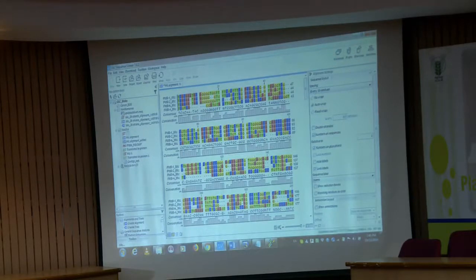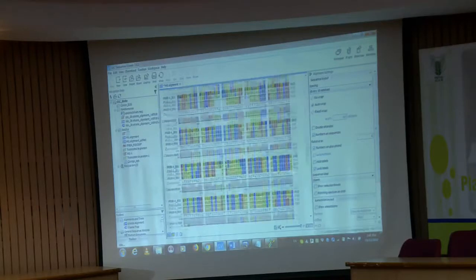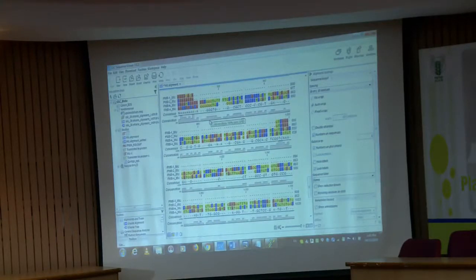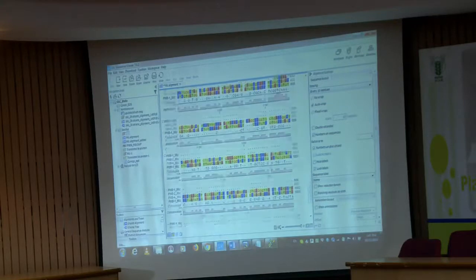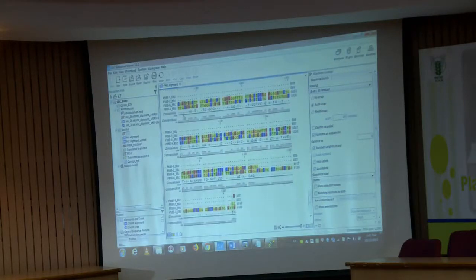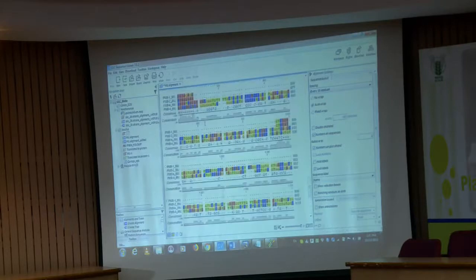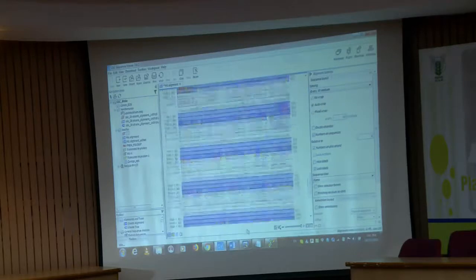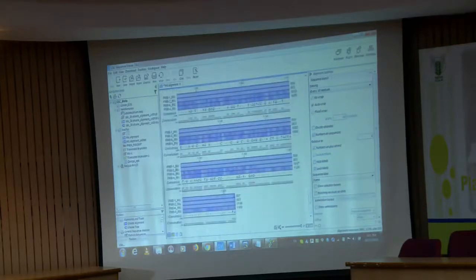So, the same thing happens in the 3' region also. Can you just see, after a certain length, I think only 2 samples are getting sequenced, but in others the sequencing stopped, right. So, what I will do, I will again select the whole thing, right click, delete selection.